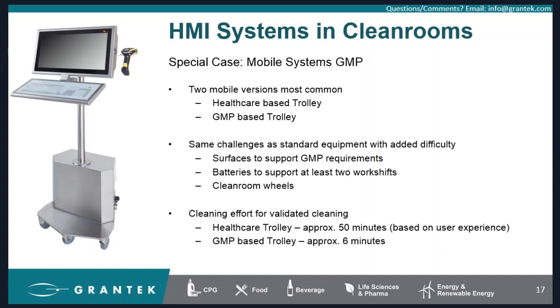But also because they are mobile solutions, they are battery powered. And those batteries should support at least 2 work shifts, so you're not constantly moving this thing out of and into the clean room again after recharging it. You need to make sure that it really lasts a certain amount of time.